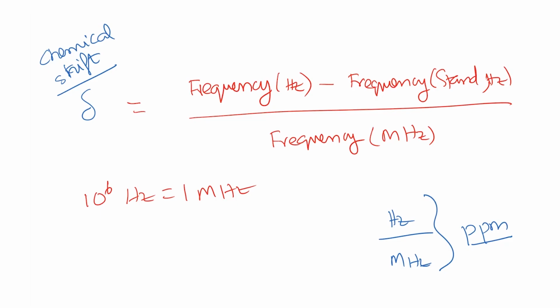All right. So, now this is useful because whichever operating frequency that you use here, the operating frequency will of course determine the separation of the energy levels, etc. But you now have a system wherein you can account for the differences in the magnetic field.